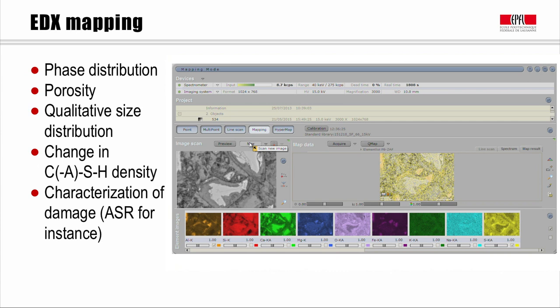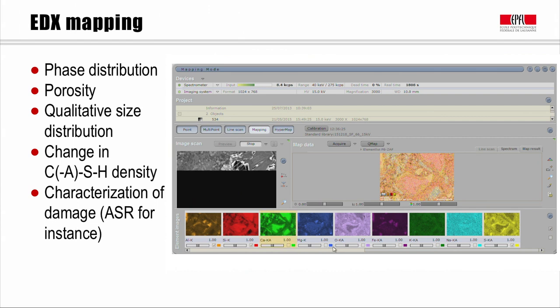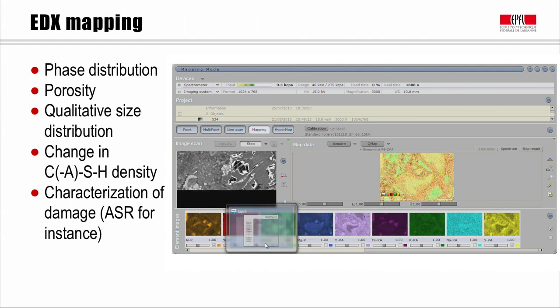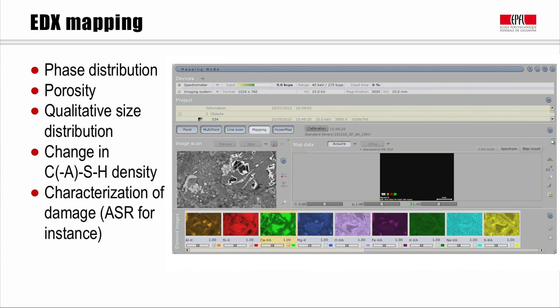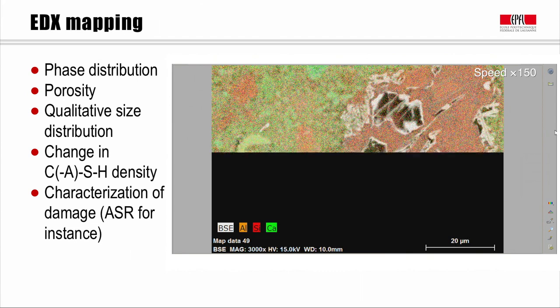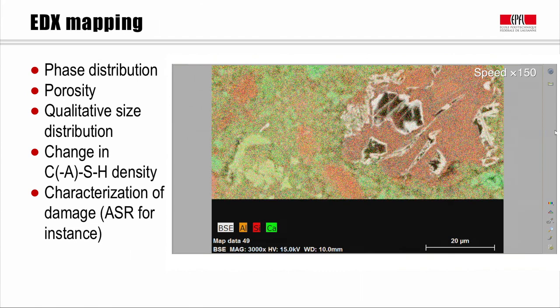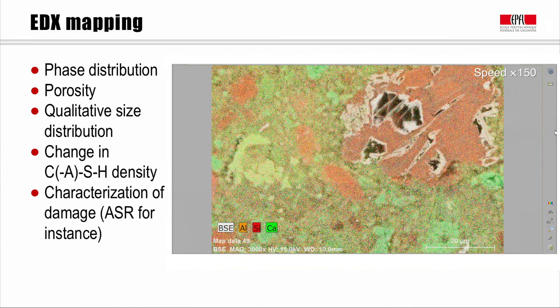Another thing you can do with EDX, which is more global, is to get a phase distribution not only on some points but on a whole map of your system, as shown here for an OPC system. You simply select the elements you want — aluminum, silicon, calcium, magnesium, iron, oxygen, potassium, sodium, sulfur — and acquire an EDX not on a couple of points but on each point of your map. This takes more time, but gives valuable indication on the phase distribution inside your microstructure. That's another very nice example of how we can use microscopy for cementitious materials.